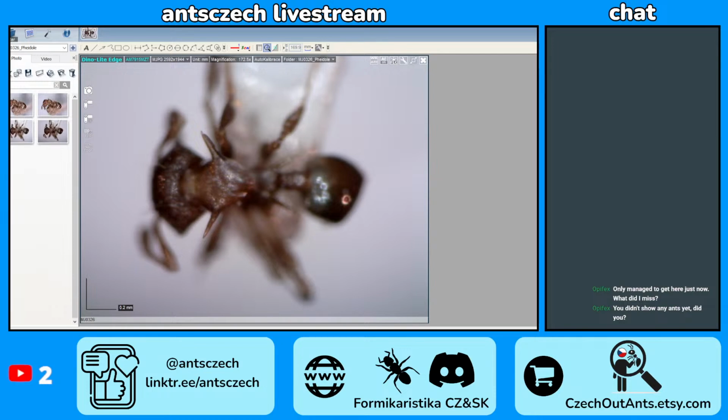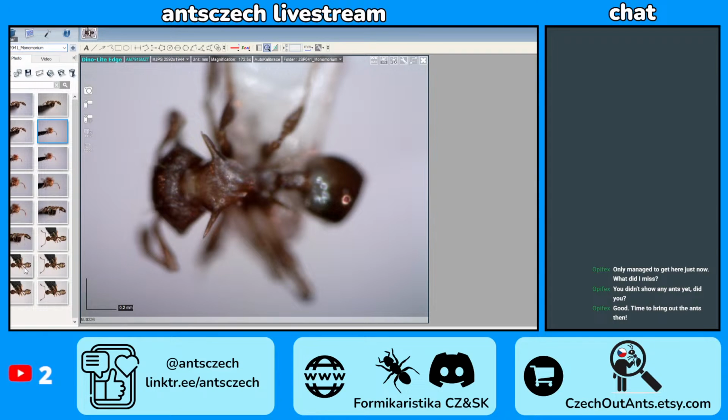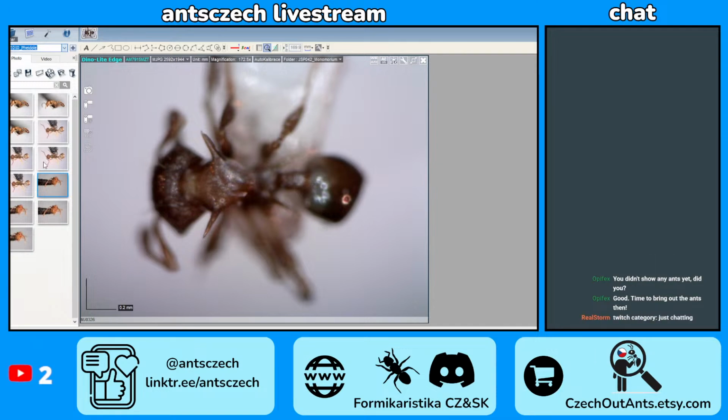I can quickly show you the pictures I made during the stream. There's not that many. I made pictures of just this Monomorium. That's one. Then the other, just the same species, same colony, same everything. Or hopefully the same colony, because it was collected a bit randomly from what I was told. And now I'm looking at some Papua New Guinea Pheidole.